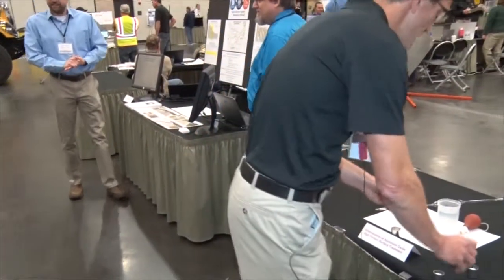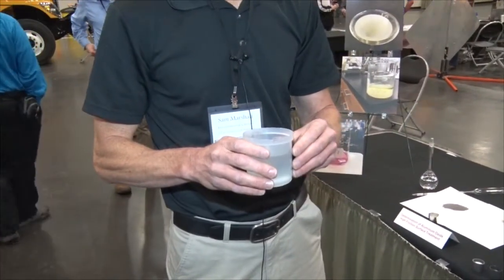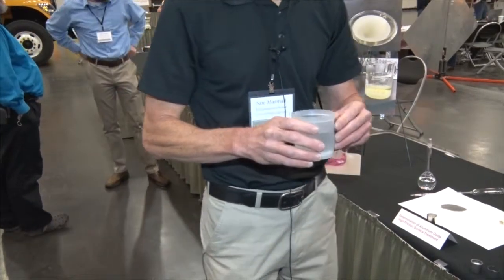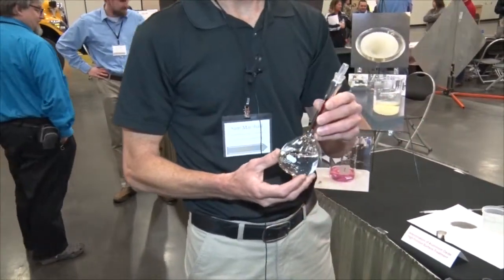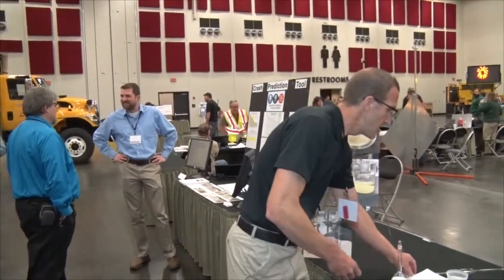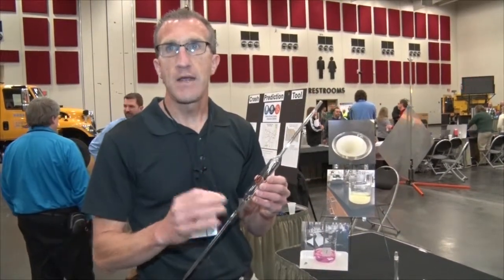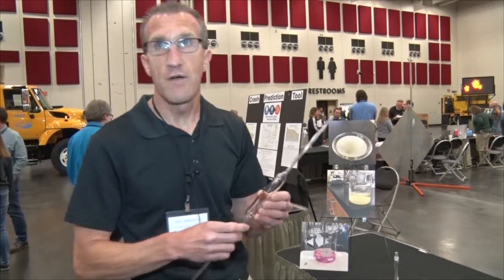And what you'll do is drop that fused bead in a dilute nitric acid solution. The reason you use nitric acid is because metals are stable in nitric. They won't precipitate out, they'll stay in solution. From there, I will transfer the sample to a volumetric flask. So I have a known weight to start off with. I fuse it, I dissolve it, and then I take a sample out of it using a 50 ml pipette. So I started with 0.2 grams to a 200 ml volumetric, and I'm taking 50 mils out, which constitutes 0.05 grams. So I know my grams when I start off with.